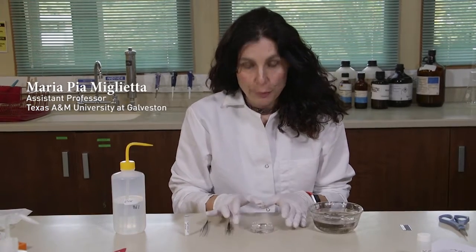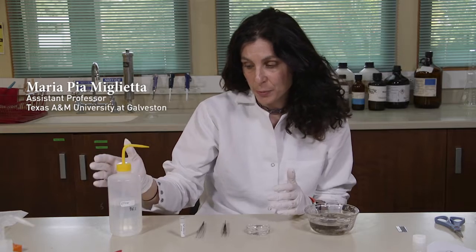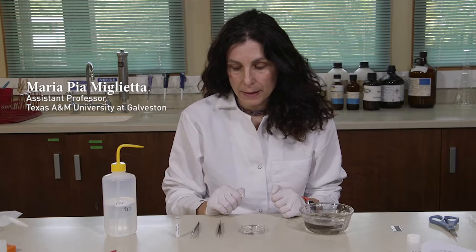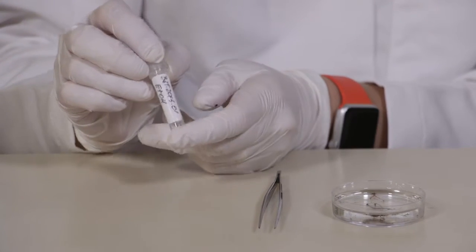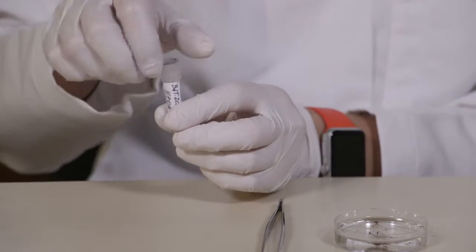Now we're going to preserve part of this colony in ethanol for molecular analysis. You will need ethanol 96% to 100%, and tweezers. It's very important that the tweezers as well as the glassware and the plasticware have never been in contact with formalin, because formalin can interfere with molecular work. I have already a vial with the label, already filled with ethanol. You can label the sample the way it's more convenient for you.